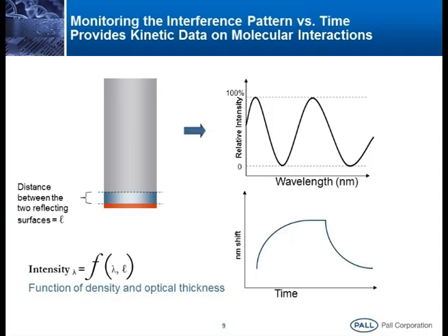Okay. See, this is what we call the association phase. As the molecule starts binding to the binding partner, we can see the curve rises. We call this association. Once we bring the same sensor back to the buffer, the bound molecule on the receptor gets washed off. Now, we can see this phase, which we call the dissociation phase. So, dissociation divided by association we call the affinity.